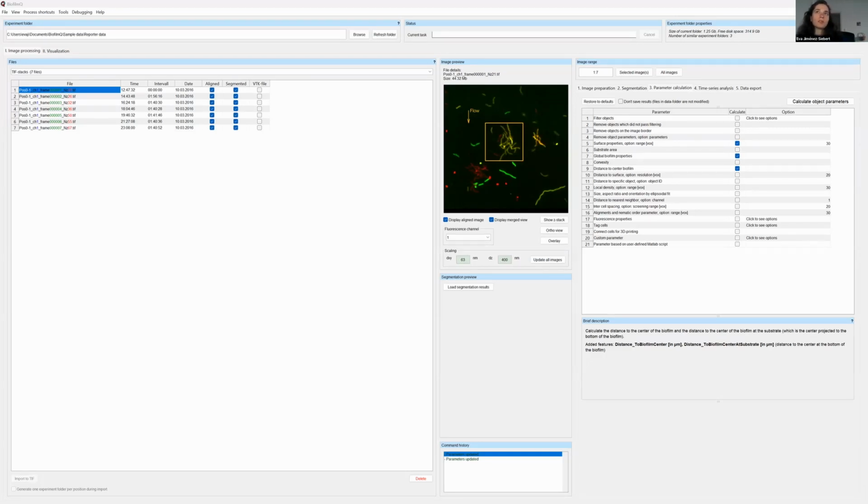If the fluorescence quality is very different between the different time points, you can still try to do that, but if you have a lot of bleaching, for example, you might have to use a manual threshold. I think that is kind of the rule of thumb.